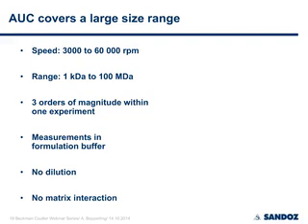So if you want to have a look at, let's say, your monomer, dimer, and some higher oligomers, you may fill the cell as full as possible and run it as fast as possible. But afterwards, you may analyze it again, looking at higher oligomers and running at 20,000 RPM, for example, to look at the high megadalton oligomers or even submicron particles.